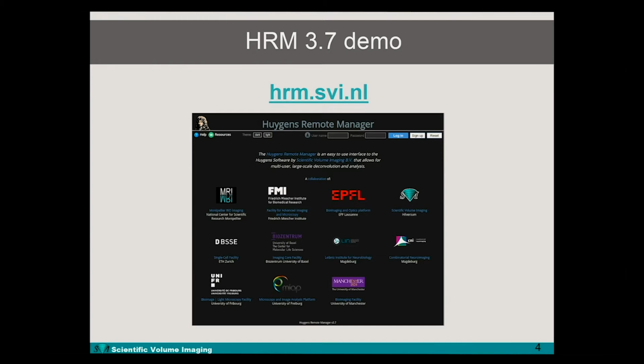And if you have your own production HRM that's offered by your imaging facility, I can imagine that using your own production machine is best for most situations. But if you want to test on this installation, you're more than welcome to do so.